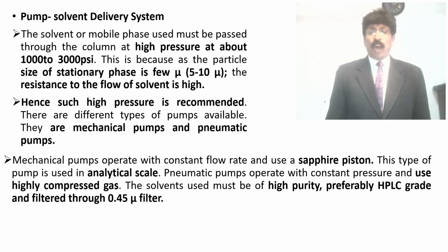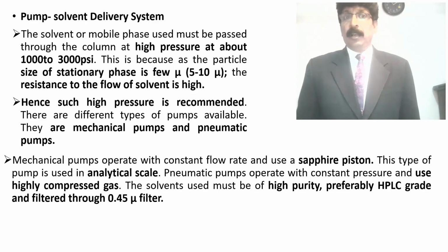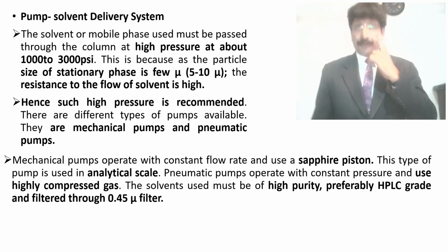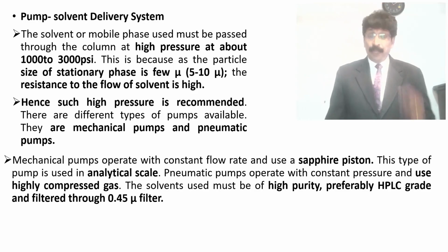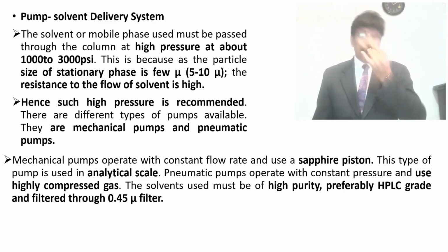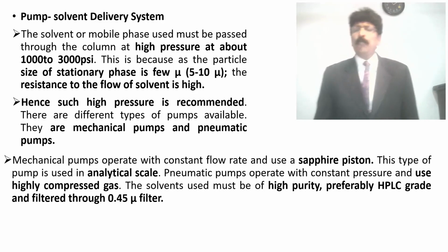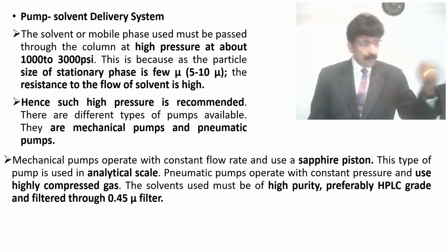The solvent used must be of high purity. When you are using it in HPLC, preferably HPLC grade, and filtered through a 0.45 micron filter. Usually, before using any solvent in an HPLC instrument, it will be filtered using a separate filtration unit.